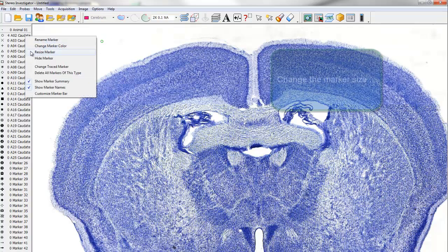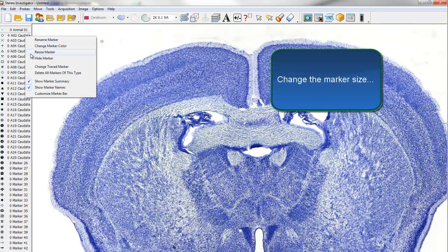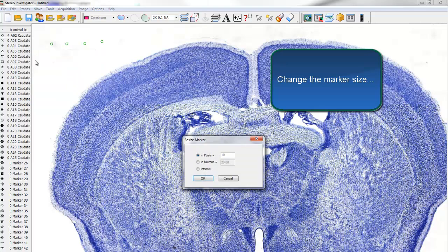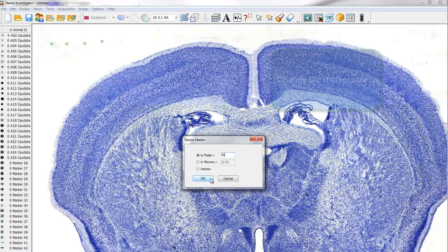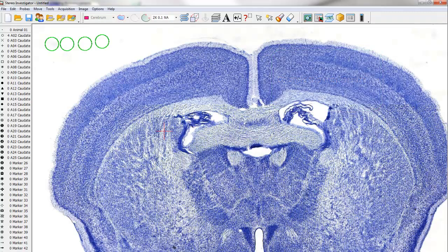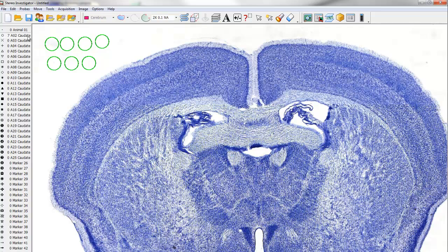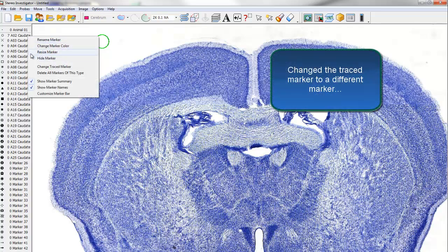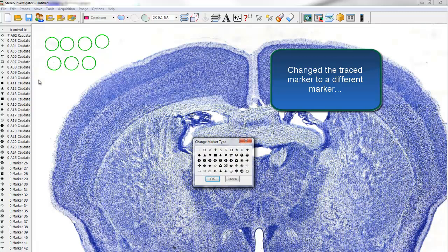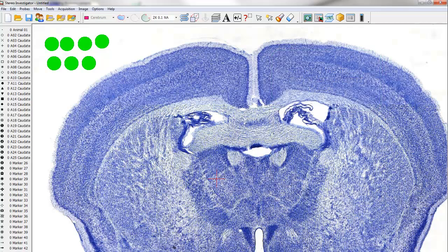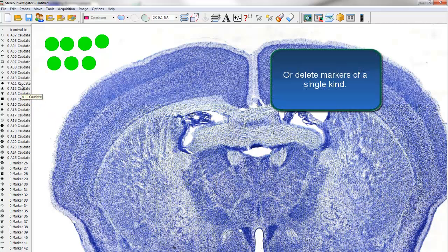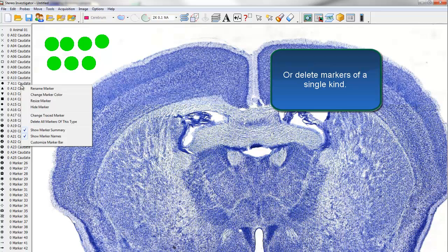Change the marker size, change the traced marker to a different marker, or delete all the markers of a single kind.